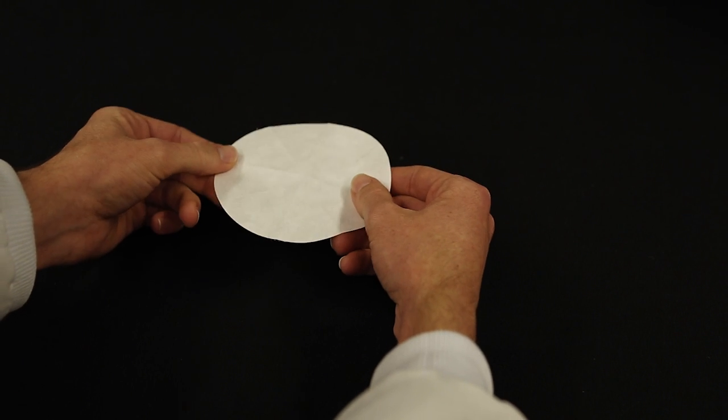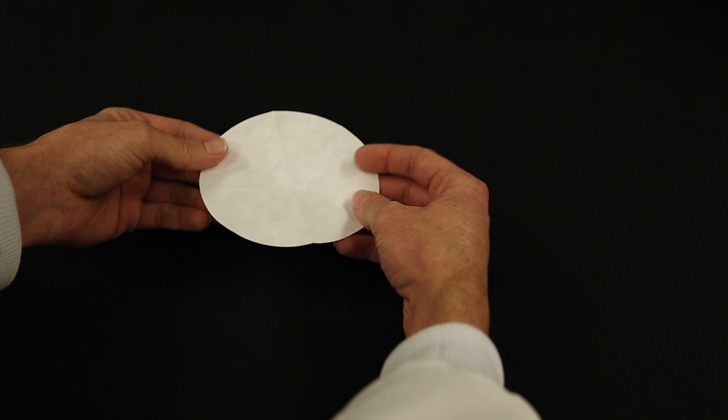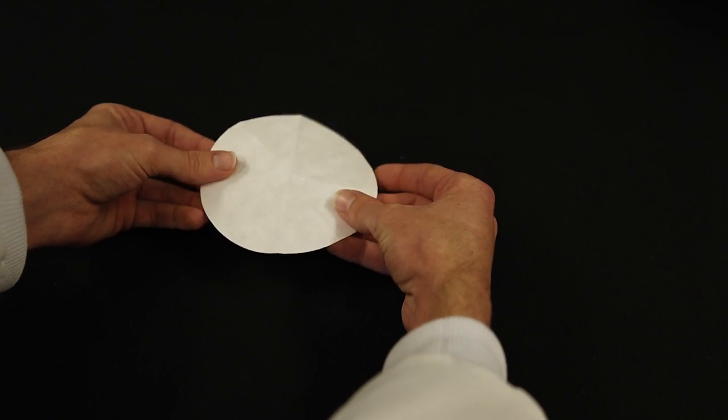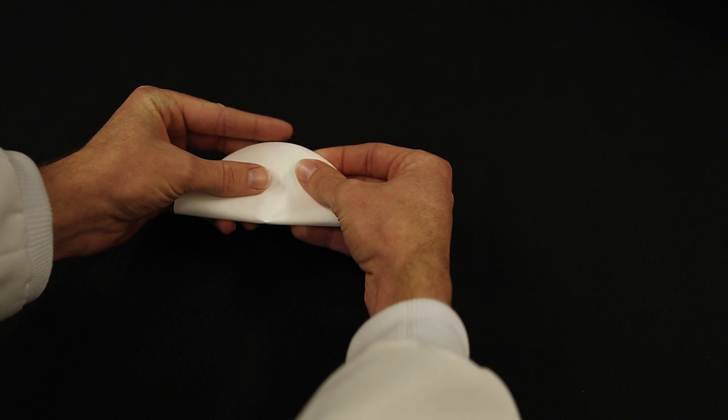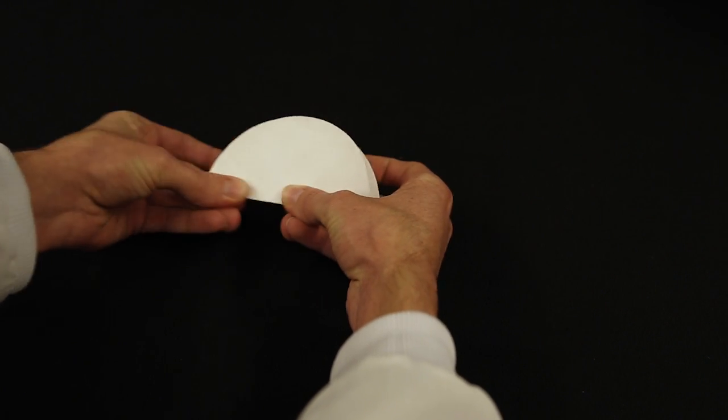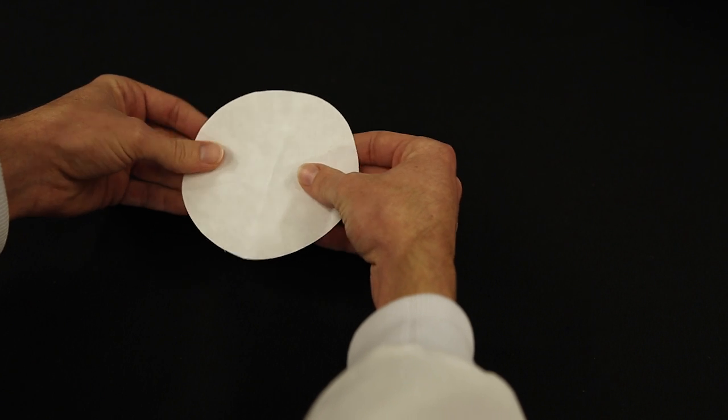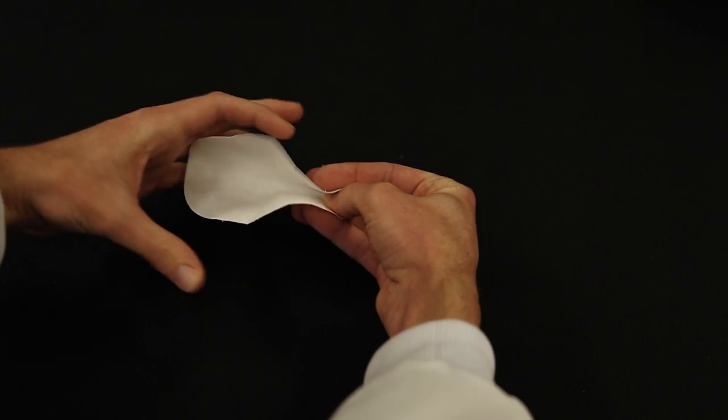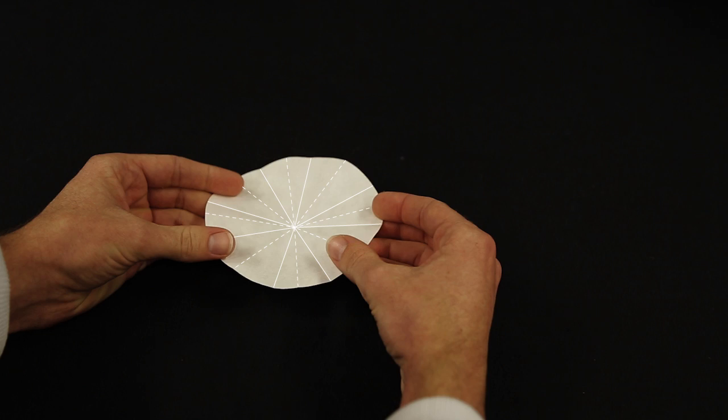Now turn it over and you will do the same thing on the other side except that you will line and fill in the spaces between the pleats that you just made. Fold it in half. Line the creases and you will do that a total of four times with alternating creases. This will give you four pleats on each side.